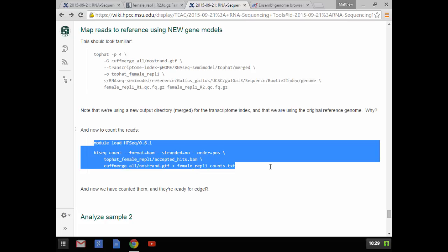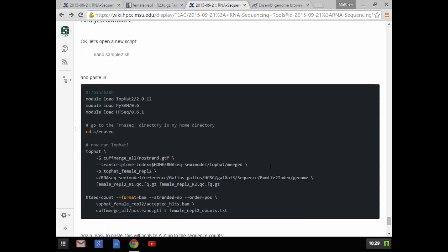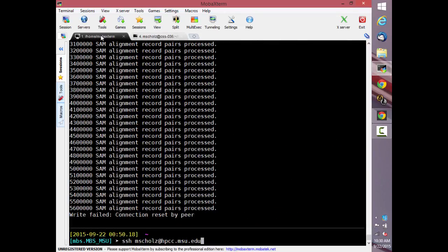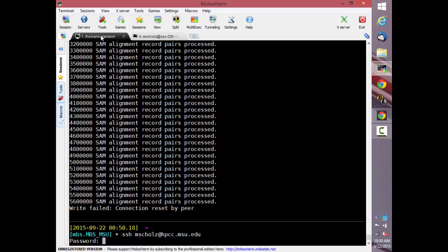Right? Right. So, green stickies when you're ready to move forward, or in fact, I'm going to go ahead and scroll down. I've got this part running already, the next sample 2. I would say go ahead and move forward trying to get the sample2.bash script that I have on the web page running, and once it's done, stick up a green sticky and we'll move forward. And in the meantime, I'm going to play with making sample 3 on the screen.